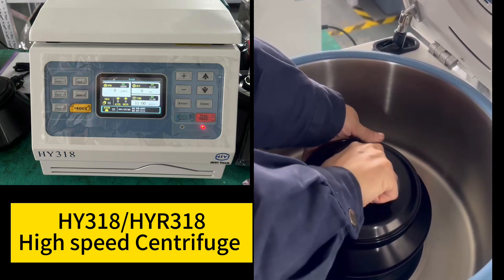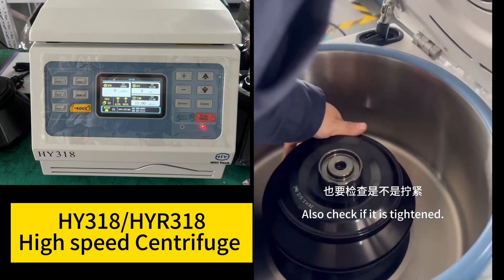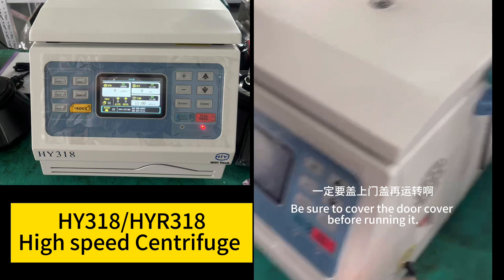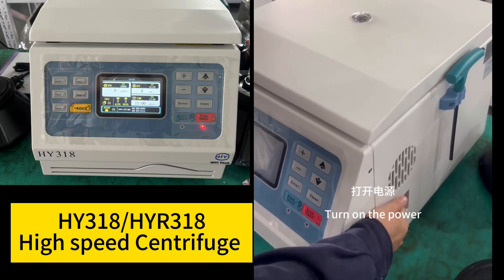Cover the lid as well. Be sure to tighten it in place and check that it is tightened. Then cover the door — be sure to cover the door cover before running the machine.